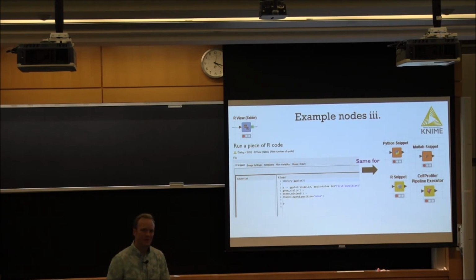Following up on that, it's a good question. If it wants to transfer some data from one snippet of code to another, does it save to file, or does it have a way to share RAM? You touch on really important points, which is how you are storing information when you're doing the processing. It depends on what you're doing. There's a bit of nuance to it, but sometimes you're going to be saving this and sometimes you're not. It depends on what profile and workflow you're using, because there are certain tricks you can do to make sure that you're not saving the files and running out of memory. But it's more nuanced than this.